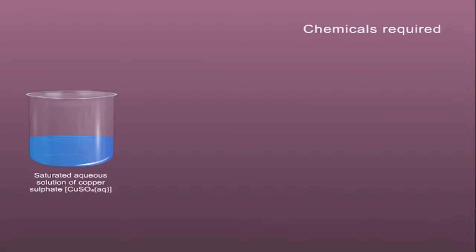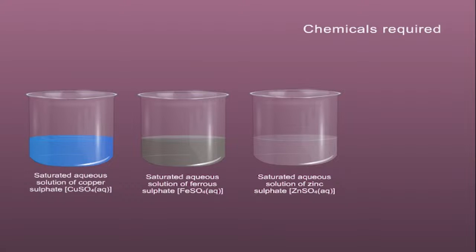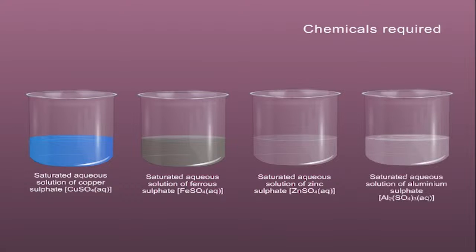Saturated aqueous solution of copper sulfate, CuSO4 aqueous. Saturated aqueous solution of ferrous sulfate, FeSO4 aqueous. Saturated aqueous solution of zinc sulfate, ZnSO4 aqueous. Saturated aqueous solution of aluminium sulfate, Al2(SO4)3 aqueous.